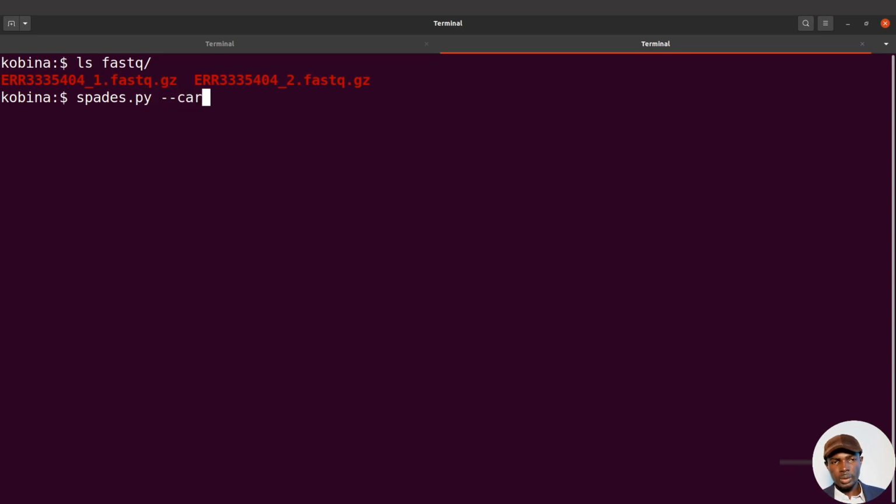And then this is how I'll use it. Be careful. And then I bring my -1. That's for read one. Let me just bring this one here. Read one. -2 $read two. And then -o. All right, it's going to be this one here.